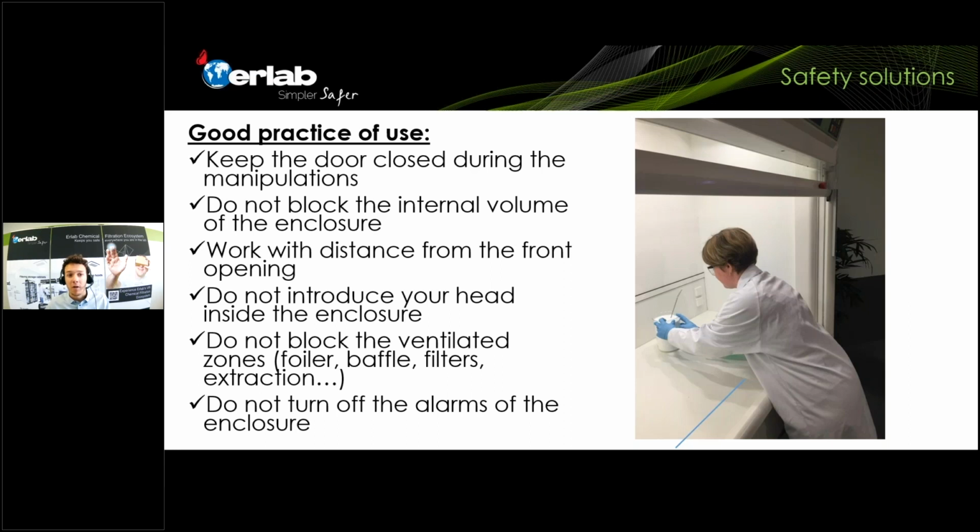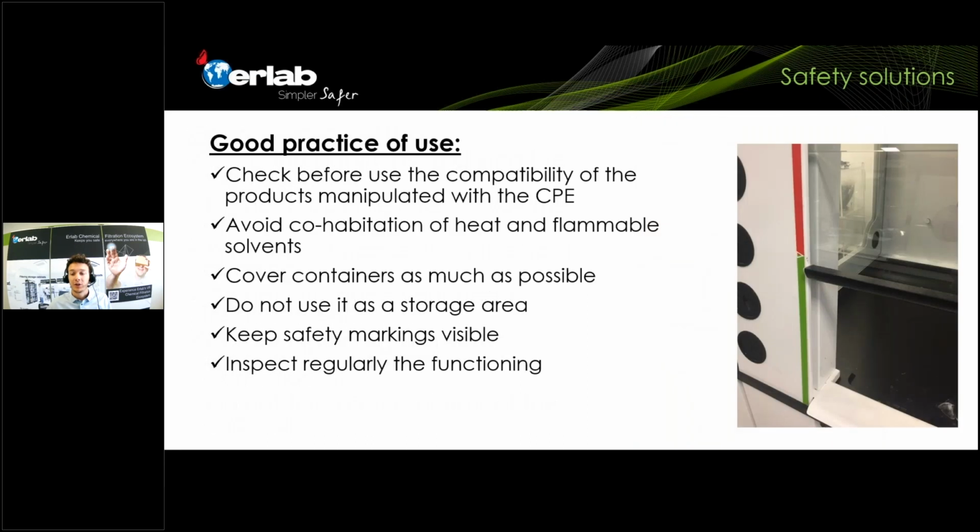Of course, never block the internal volume of the enclosure. The containment is only really efficient if you don't disturb the airflow, so the airface velocity. Work with a distance from the front opening, and do not introduce, of course, your head inside the enclosure, as my colleague here on the picture is doing, which is not really a safe way to operate. So these are a few good practices when you work with a fume hood.